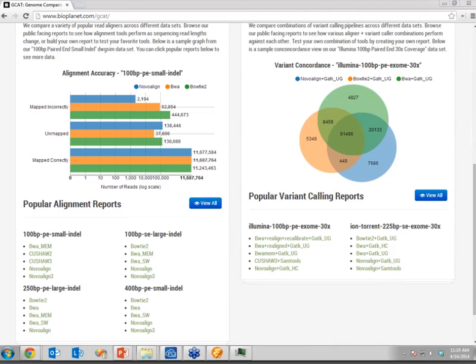Okay. Can you talk just a little bit, not a full hour, about how to align polymorphic regions such as HLA? Well, that's a good point. So I would classify that in my regions of problems, not in the responsibility of the alignment and variant calling to solve. It is fundamentally a very large-scale problem of having entire genes, having dozens of pseudogenes that are very highly similar, and a 75 base pair read, or even a 250 base pair read, is just not going to cut it. You will be able to align it to all the pseudogenes into one spot or multiple spots, etc. Ultimately, with those regions of the genome that are that polymorphic, you either need a completely different sequencing technology or a different technology like long-range PCR to properly assay them.